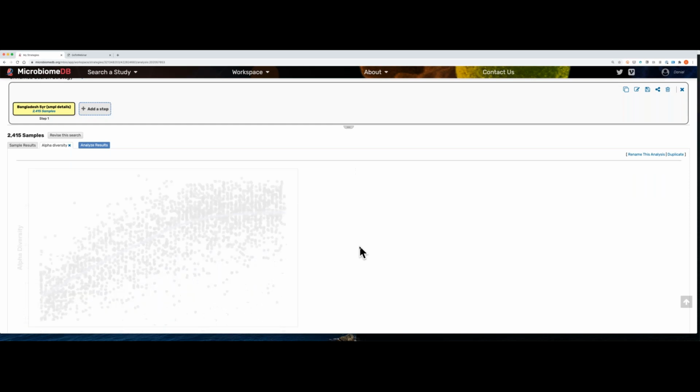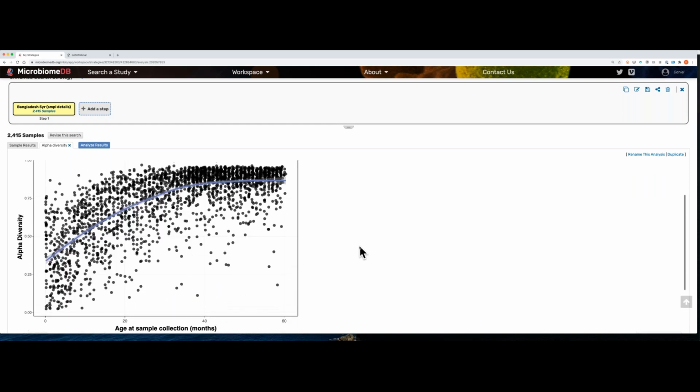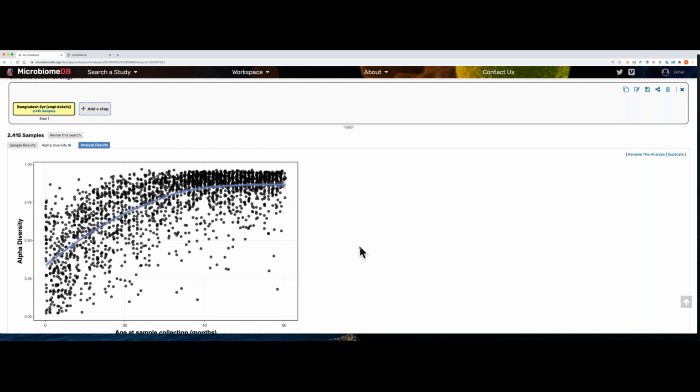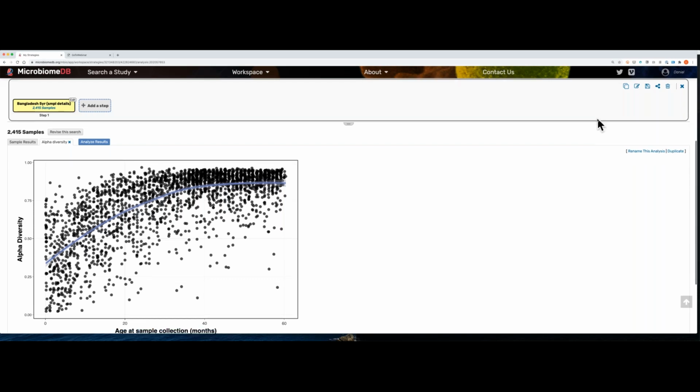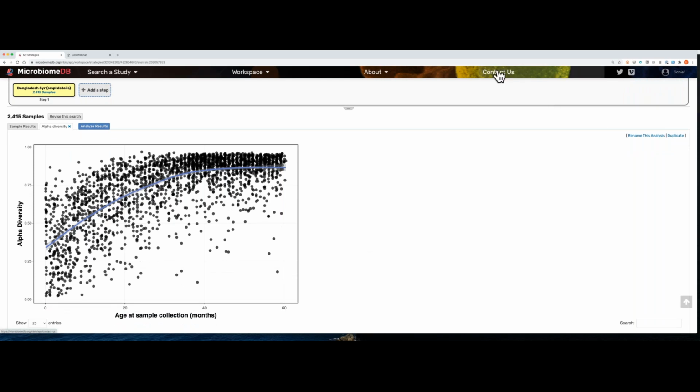And by the way, if any of you are wondering whether there's features or metrics available that you like and you check and find they're not, that's a great opportunity to contact us through the contact link, and we can see whether that makes sense to add that to the site.